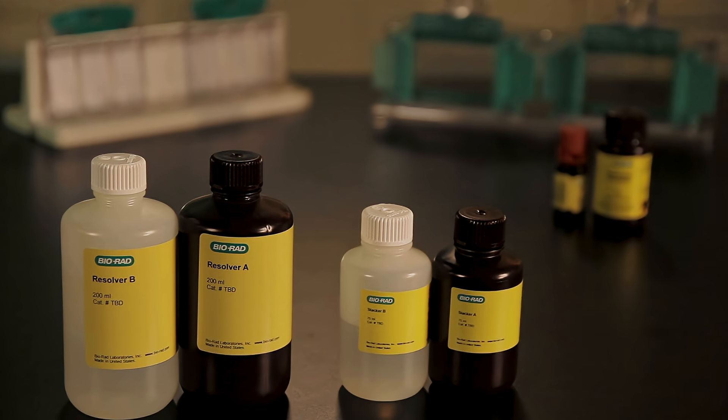The stain-free gels can be visualized in 5 minutes or less without staining. Fast-Cast kits are available in 3 different percentages.